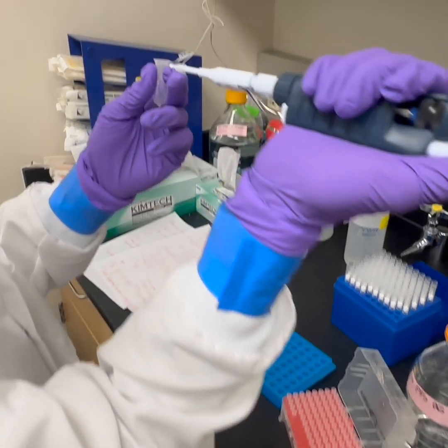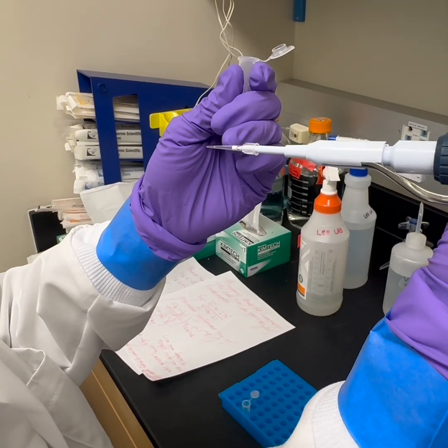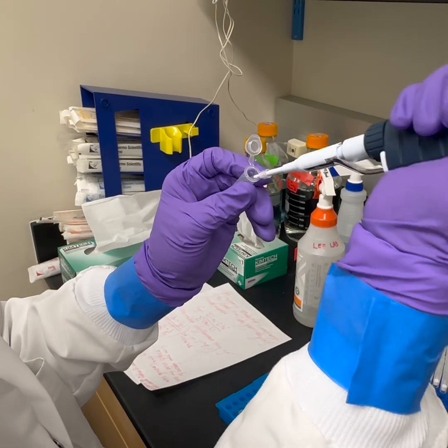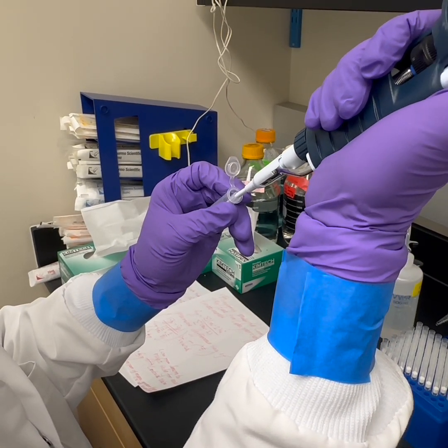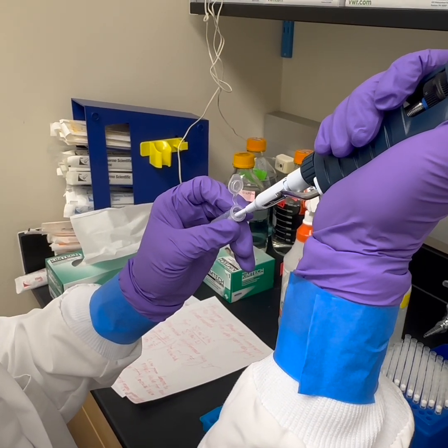Okay, so you'll see it should go to that line. It might be hard to see on the camera. This one is not because these haven't been calibrated. And so you'll want to over pipette until you actually get to that line for an accurate count. So I'm going slightly past the first stop.